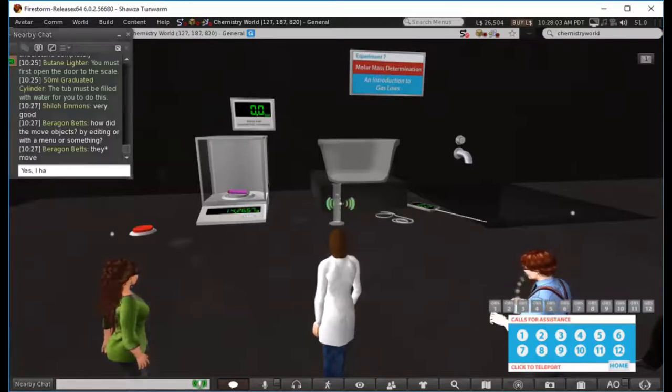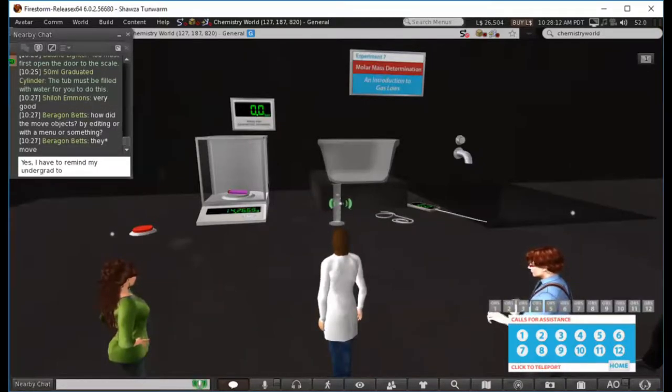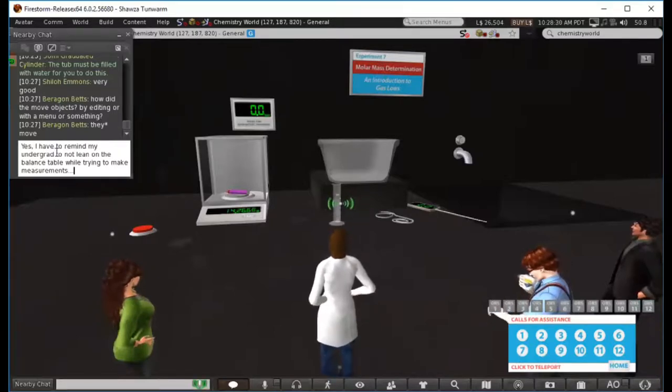The scale is sensitive to a tenth of a milligram, which is not very much mass. And so air currents cause a fluctuation in what the scale is measuring. So good laboratory practice would require the students to shut the door, and then the scale reaches a constant mass, and that's what they record. So we may have erred too far in some cases requiring the students to do every little thing, but in other cases we really had a reason for expecting them to do that.